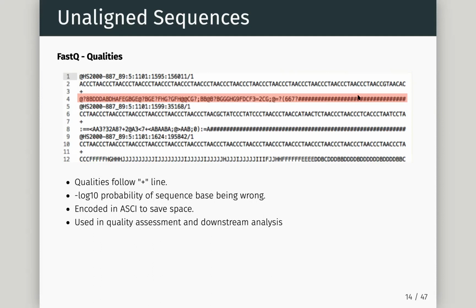The fact is that's not always accurate. Sometimes colors overlap, and sometimes it can't quite get the image correct. So that whole step is called base calling. And there's a program called BCL to Fastq, which I think is the only base caller anyone ever uses for Illumina. That changes what is stacks of images. If I sequence 100 bases, I have 100 stacks of images. It goes through these images and works out, okay, at this position in my flow cell, I had a sequence and an A went there. That position was a G, T, and C. But it knows, okay, it has a probability of being any of the bases. And if its probability of being both an A and a T are kind of high, it starts to downweight this score. So all these quality scores here are from how likely it is a G, C, T, or an A by interpreting that image.